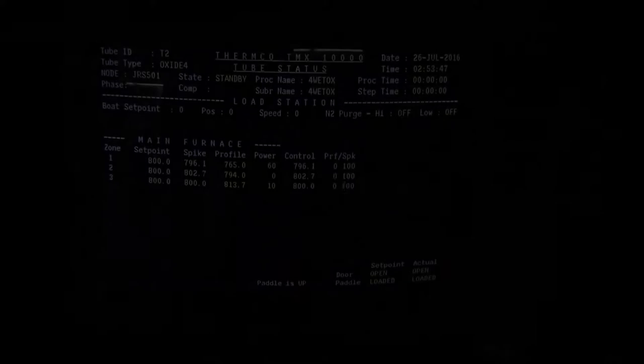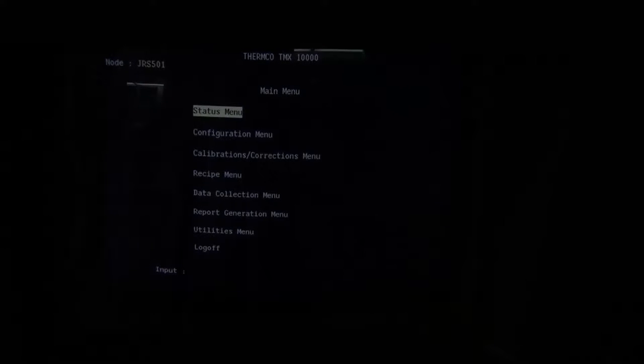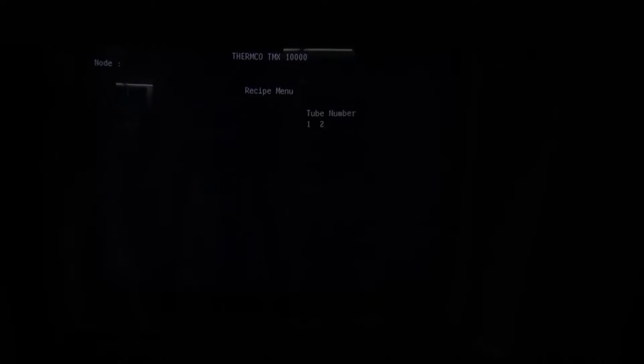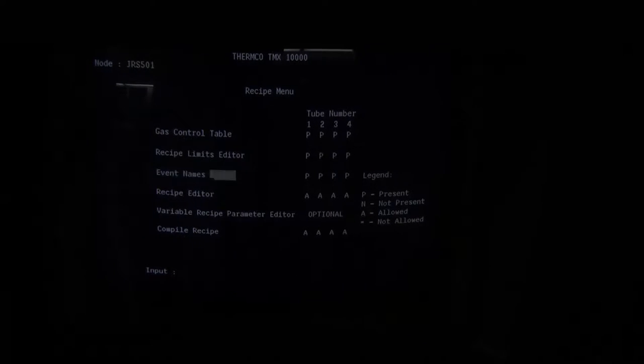Press the Do key until the main menu is reached. Use the arrow keys to highlight recipe menu and then press Return. Use the arrow keys to highlight compile recipe and then press Return.